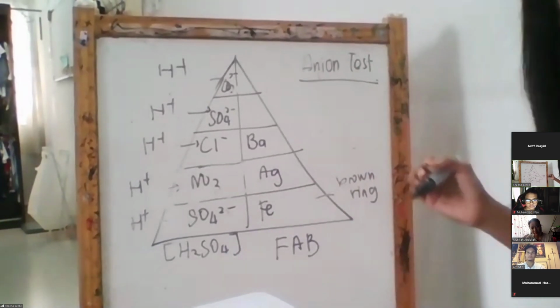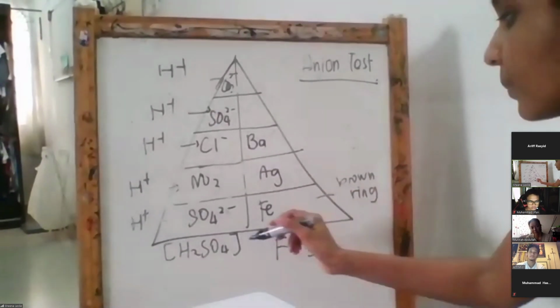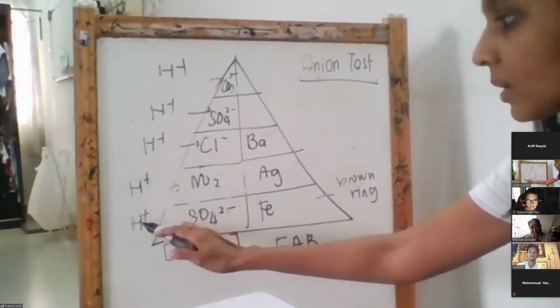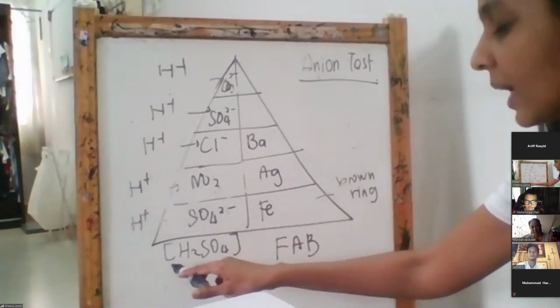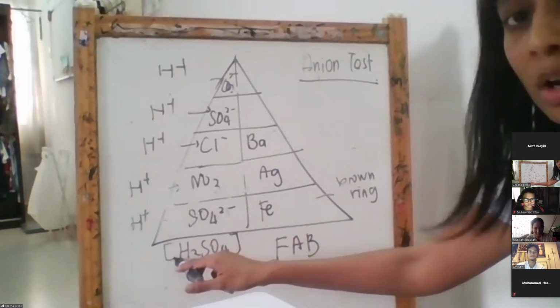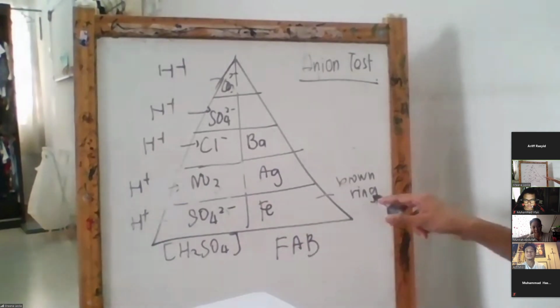Do you get what teacher is saying? Yes. Okay, so what do I add first to test for nitrate? Sulfuric acid, and then I add iron(II) sulfate, and then only for nitrate is special. I carry on by adding a third one. I add concentrated sulfuric acid. I will get a brown ring.